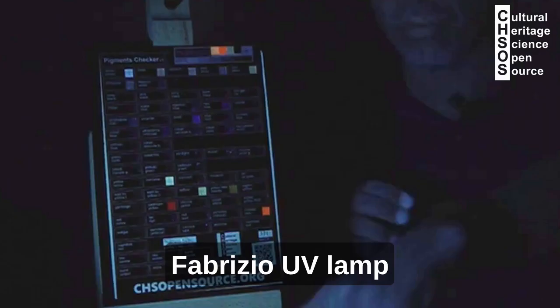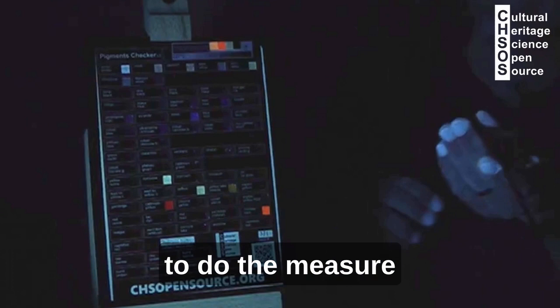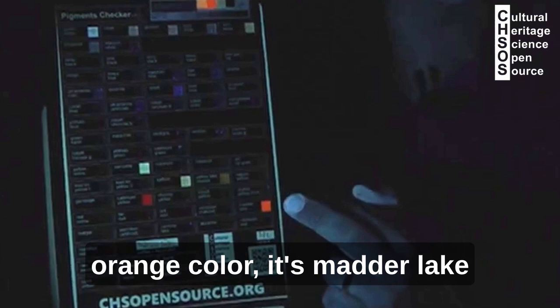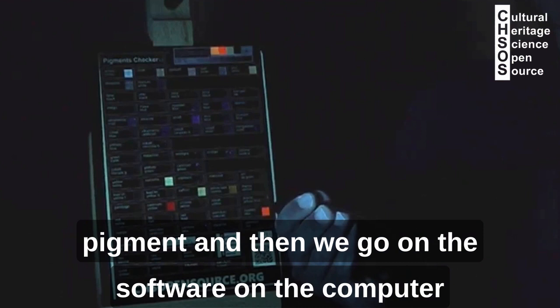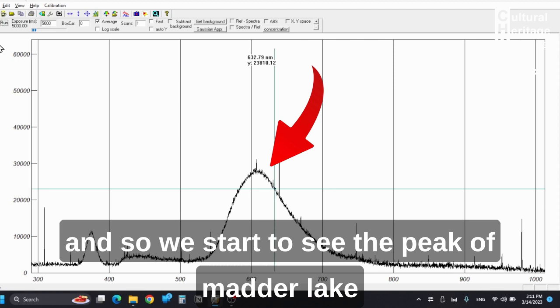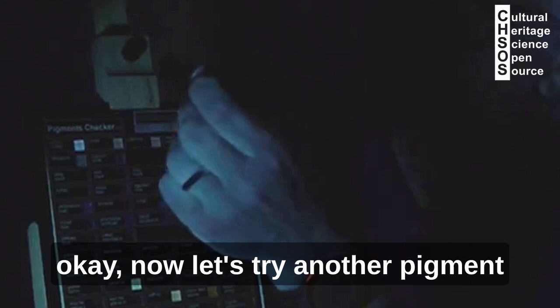We turn off the lights and turn on Fabrizio UV lamp. To do the measurement, we apply the probe close to the area we want to measure the fluorescence. For example, here we have this orange color which is Madder Lake, so we put the probe at about one centimeter from the pigment. Then we go on the software of the computer and we start to see the peak of Madder Lake.